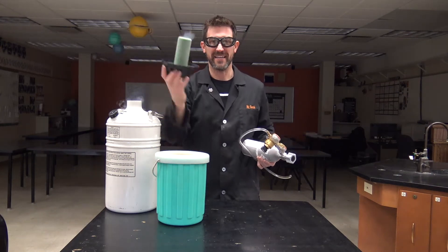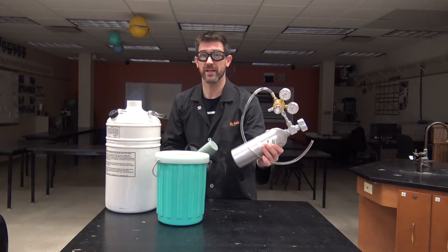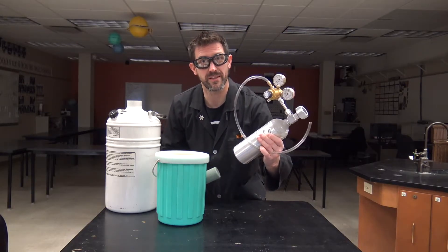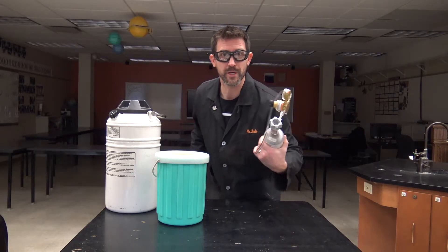Welcome to Beale Science. Today things are about to get a little bit crazy. We've got some liquid nitrogen and we've got some oxygen, and we're going to take the oxygen and turn it into liquid oxygen and then we're going to do a little experiment. So stick with me, let's do this.